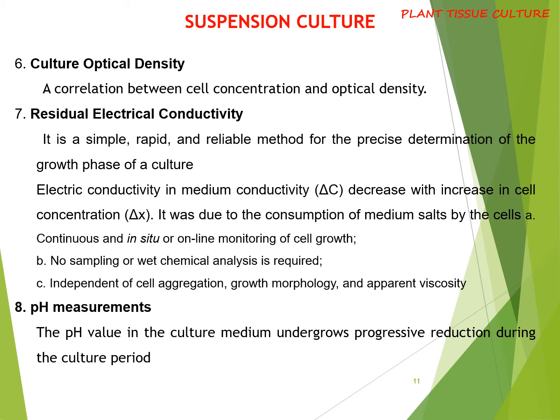Another method is to continuously check the pH of the suspension media. The pH of the media reduces during culture period. Certain probes are utilized to check the pH of the media at frequent intervals.